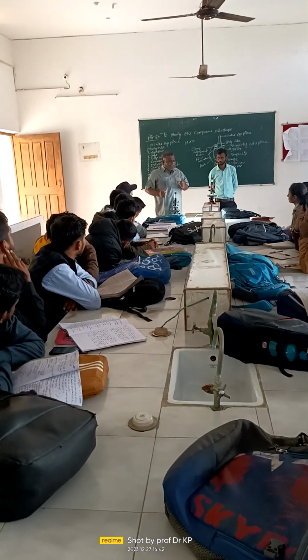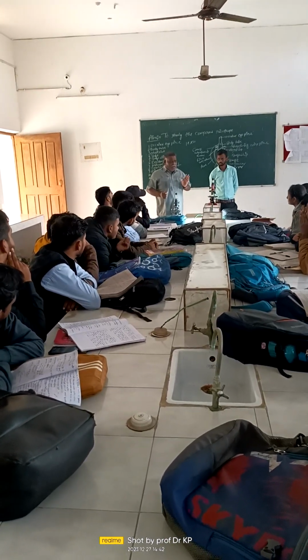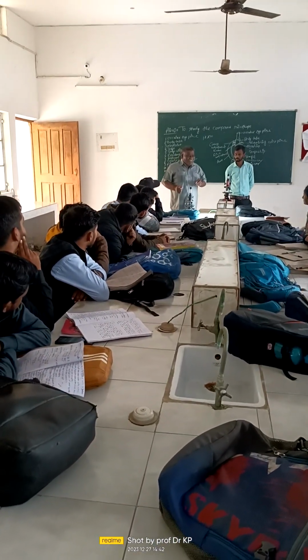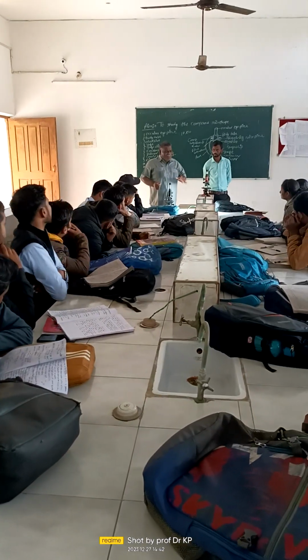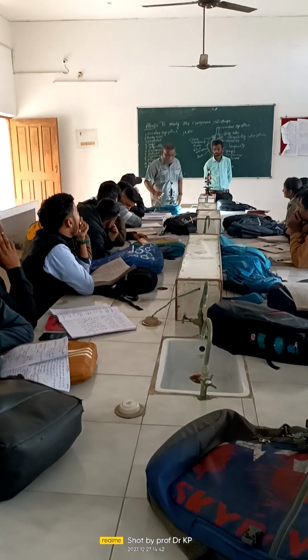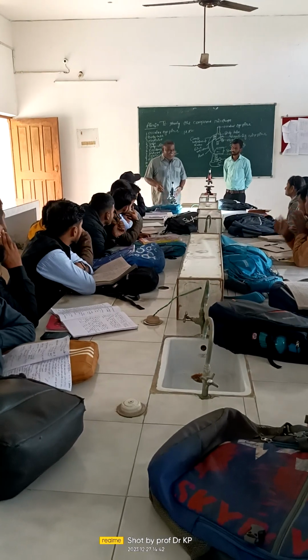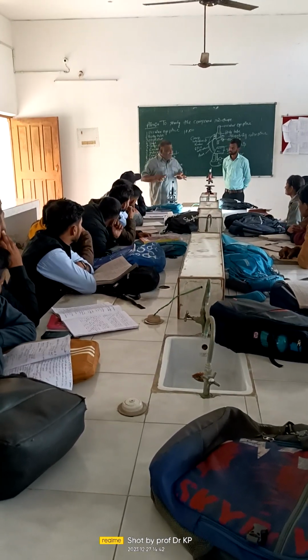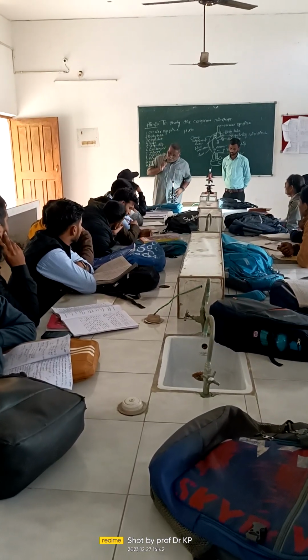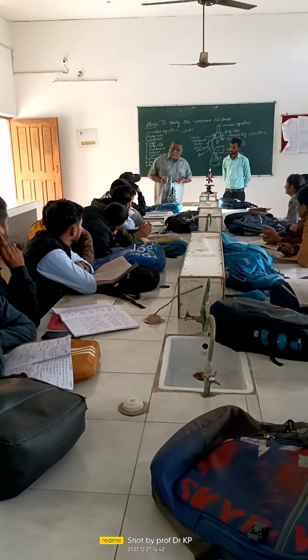Clear now? If the structure is not clearly appearing, the main trouble is the intensity of light and the nature of the structure. If the structure is whitish in nature, it will not take any light, only reflection will be there mainly, and the structure will not appear. So you have to use the diaphragm to reduce the light so that the structure will appear. If the structure is very coarse and bigger in size, you have to open the light as much as possible. If it is very fine, you have to reduce the light as much as possible. Reduce the light intensity and the image will appear.